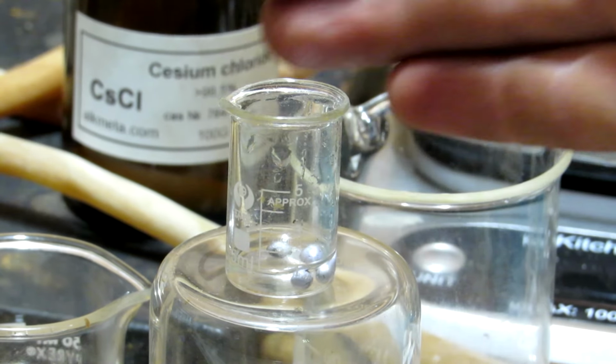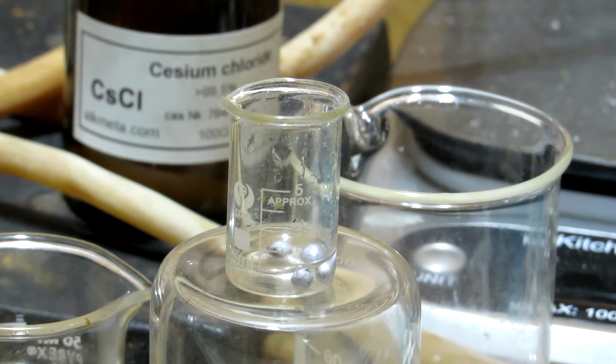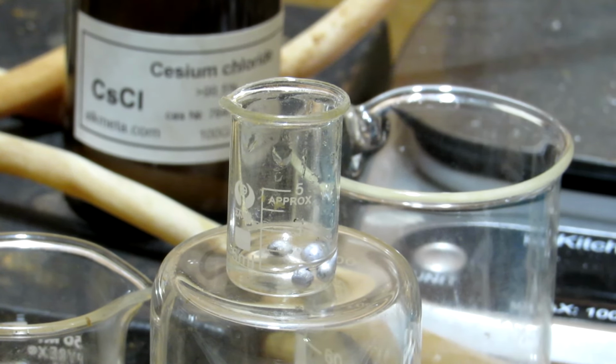A few nice shiny beads of potassium metal were obtained from element collection, and I will definitely be optimizing and repeating this experiment in the future to obtain a better yield.